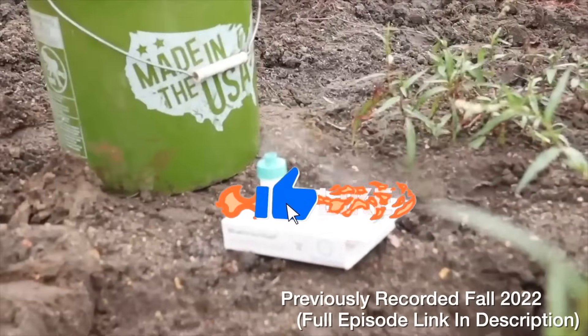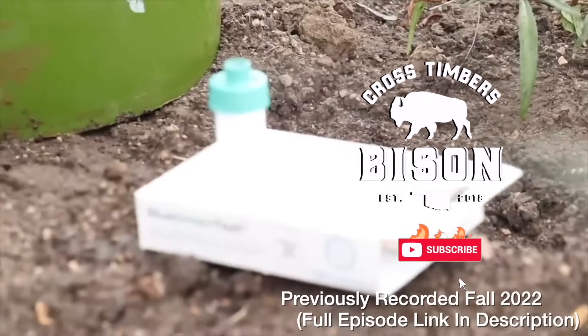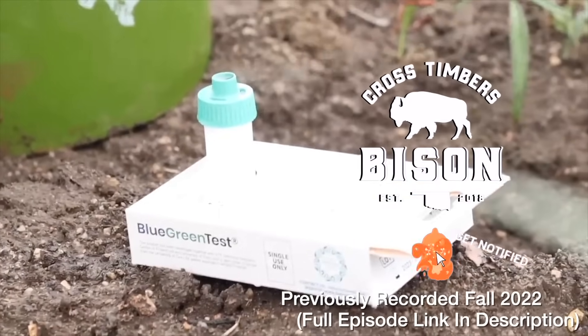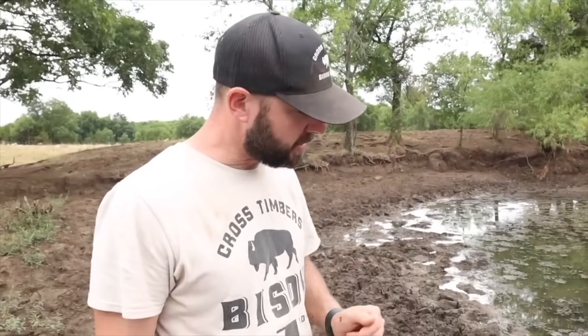We're back at the pond after doing some fence work. We've already done our first test — a whole bunch of little tests with our strips that took like 15 seconds. Now we're going to go ahead and do the blue-green algae test.